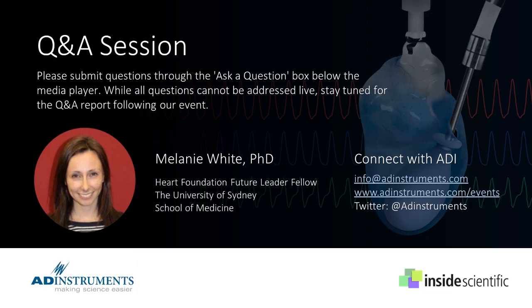So our minimum parameters, which we discussed in the presentation, we're looking for a flow rate that is too low for that equation that we discussed. So in our rat system, if we have a flow rate of less than 10 mils per minute, this is indicative that the heart may not be ready to appropriately respond to, say, an ischemic insult. Same with the rate pressure product. And we use the rate pressure product because that allows us to consider both the LVDP as well as the heart rate in our consideration for an exclusion criteria.